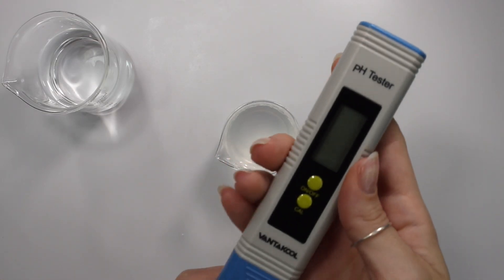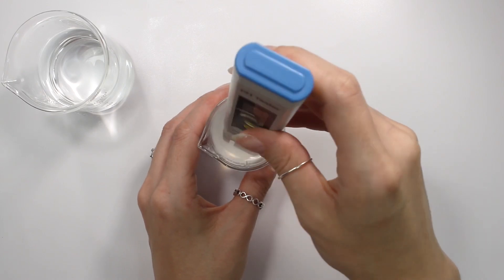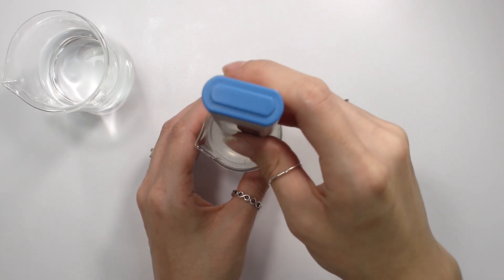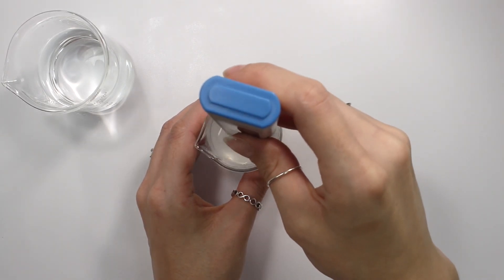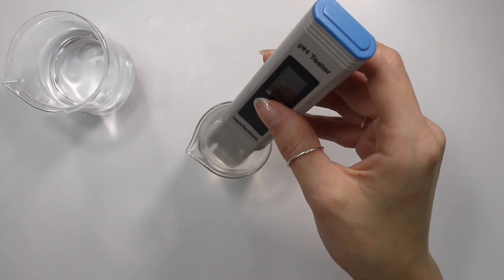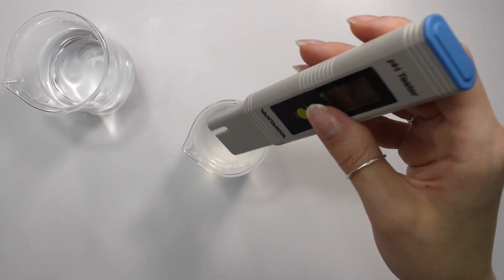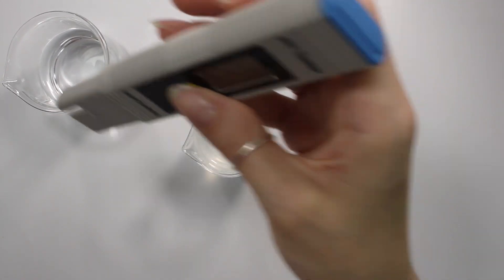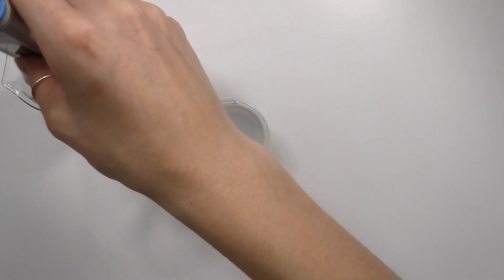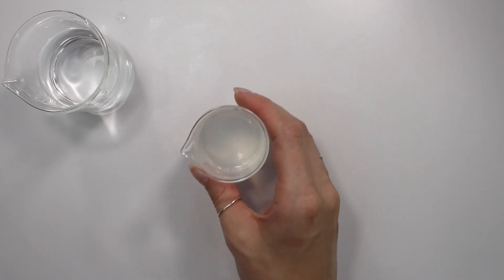So again, we're going to be doing it again with the cheaper pH meter, swishing it around in my solution for about a minute to get a stable pH reading. And this one is reading 5.93. So again, it's off by about 0.20, a little bit lower than that. So this pH meter is definitely reading differently than my more expensive one. But I mean, that's not really the end of the world. It's only off by like 0.20 if that, so it's not too big of a deal.